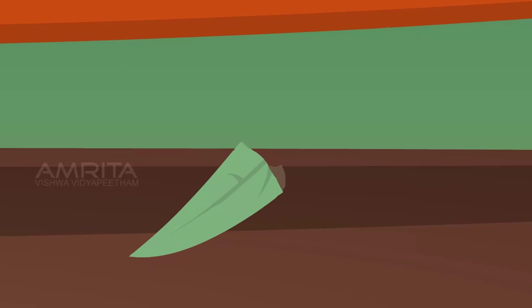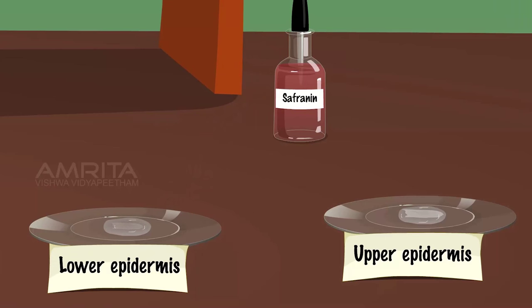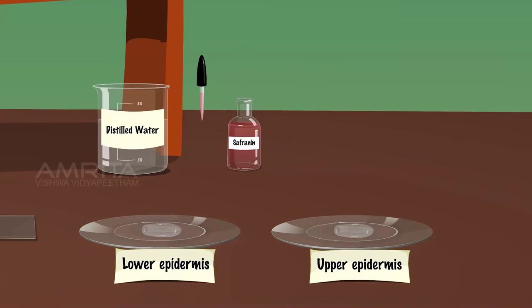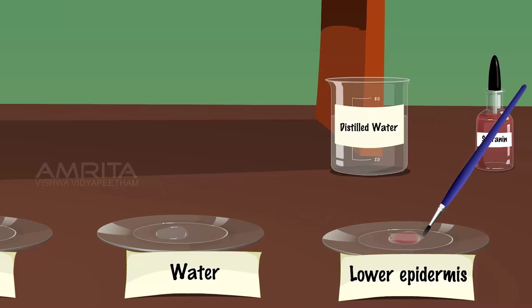Fold the leaf again and tear it along the lower side of the leaf. Using forceps, pull out a thin transparent layer from the lower epidermis of the lily leaf. Put the peel into another watch glass containing water. Take a few drops of safranin solution in a dropper and put it in two watch glasses. Take the lower epidermal peel from the safranin solution using the brush and place it in the watch glass containing distilled water.